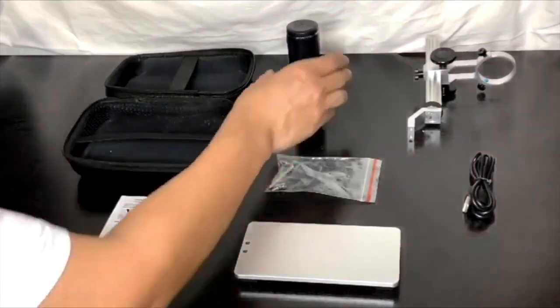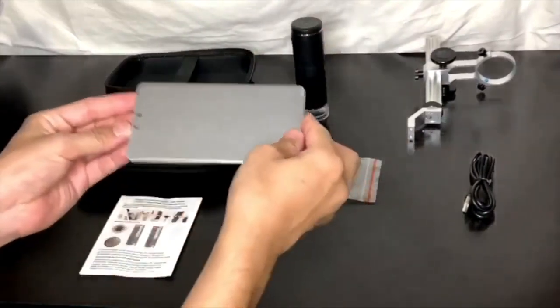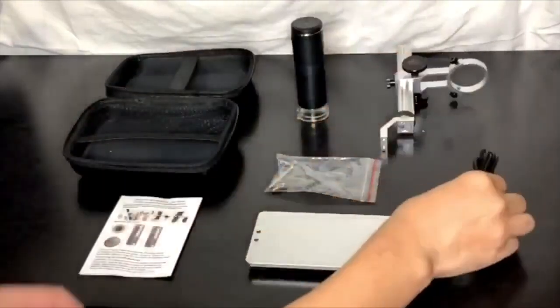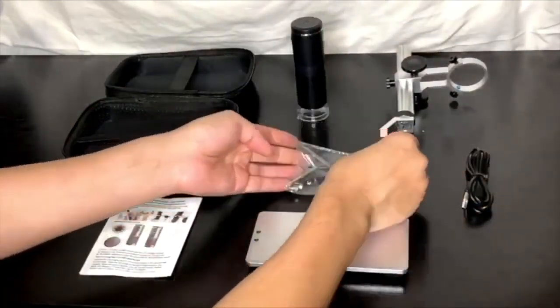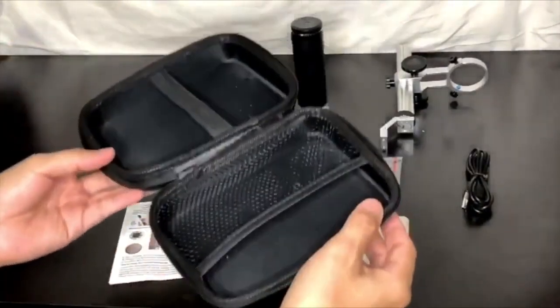The microscope package includes the microscope itself, the mounting base, mounting arm, a USB cable, the mounting hardware, the instruction manual, and a nice little storage case.